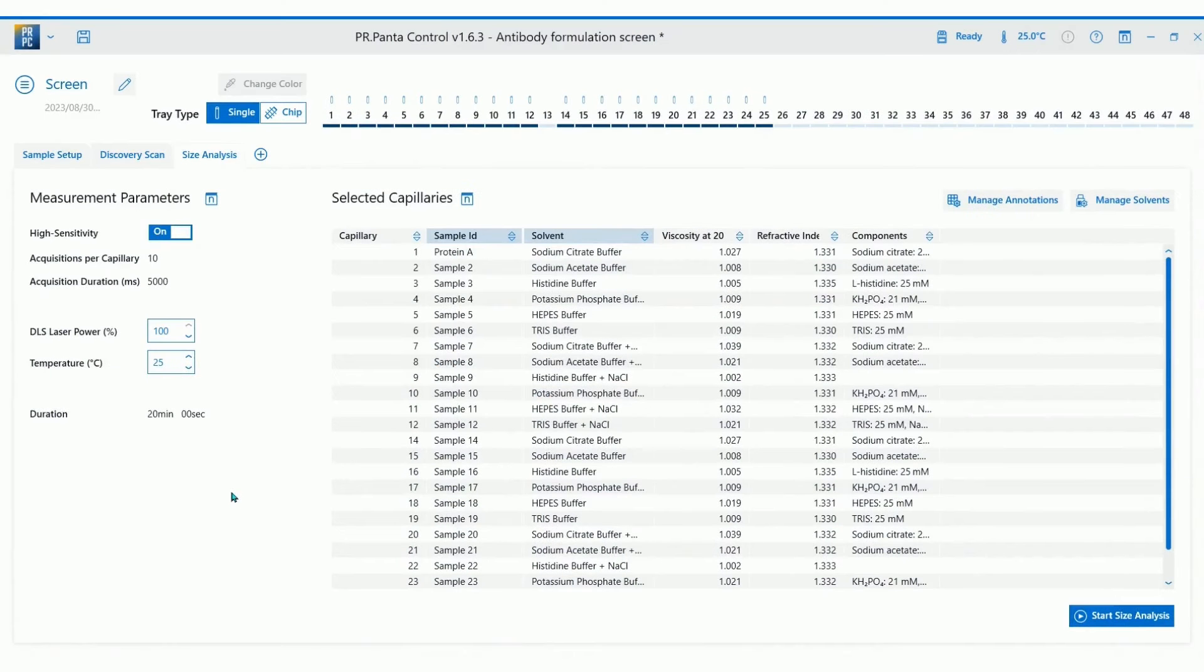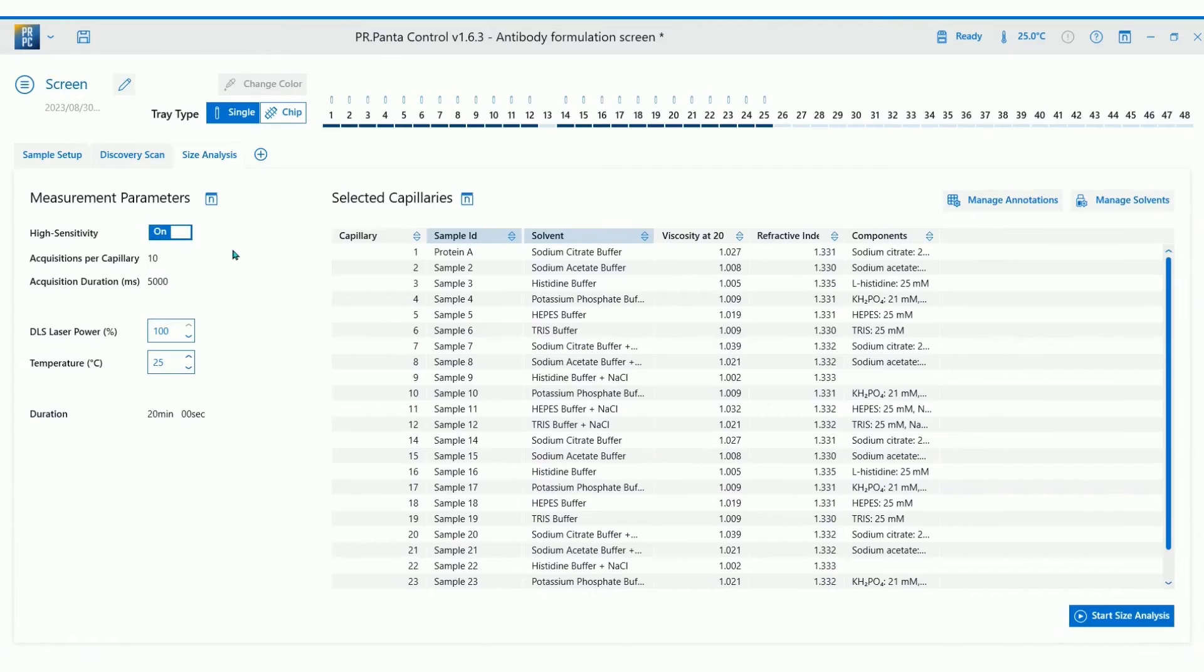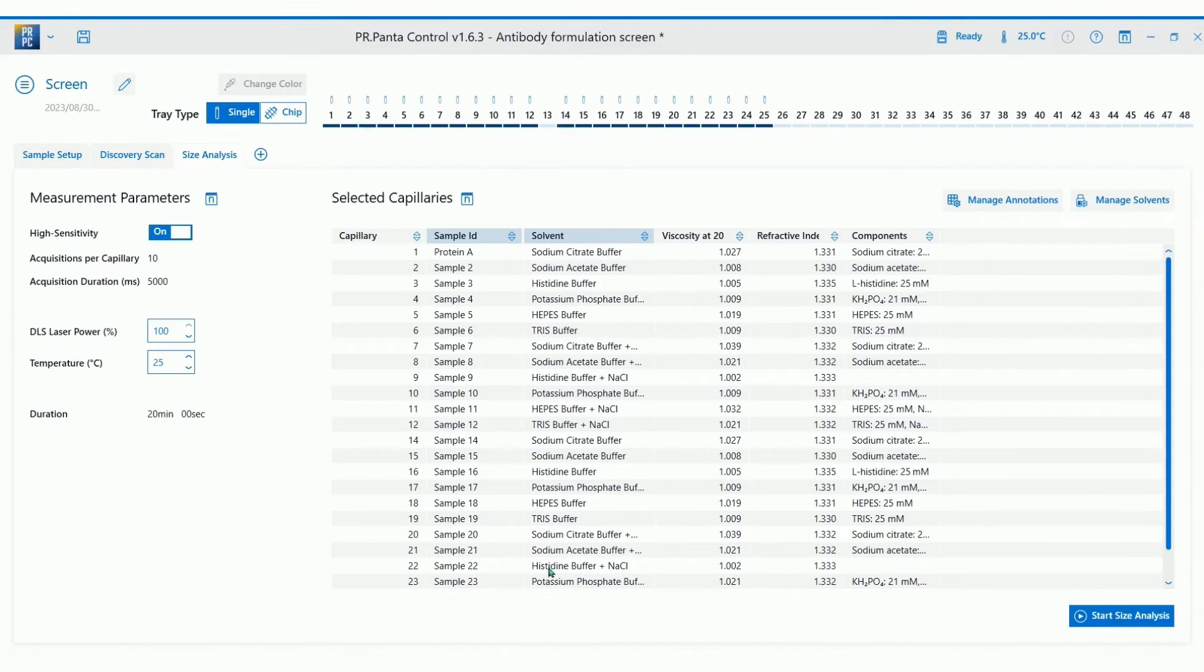On the left panel, select between high sensitivity mode and quick mode. For a quick snapshot of samples, the quick mode is a good starting point. For precise sizing results or low concentration samples, select high sensitivity mode. Then you can simply press start.